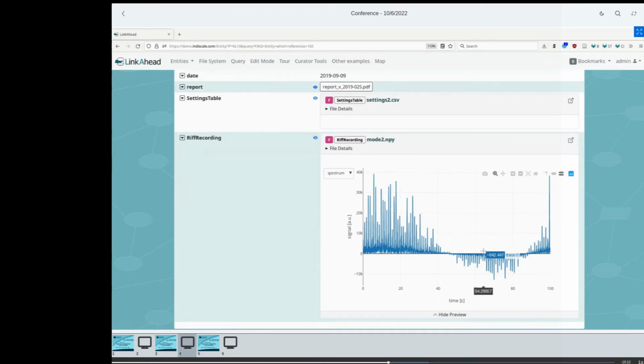Is this more or less what you were asking? Yeah, and in that direction. There's even one more file behind this file. That is already an analysis of a raw file. It's a spectrum, so you first have to have the real time domain signal which you record, and then this is already an analysis of the raw record file. Yes. But in your actual example, of course, it would also be possible to store the raw record file as a file reference here as well. Yes, thanks.